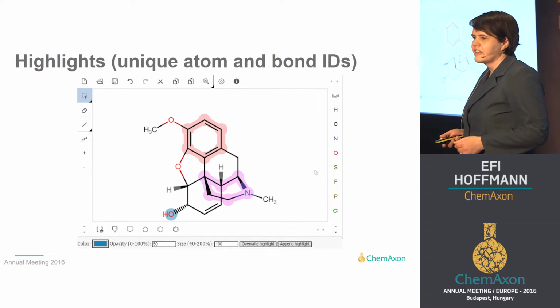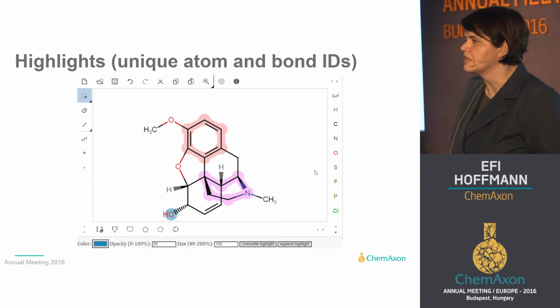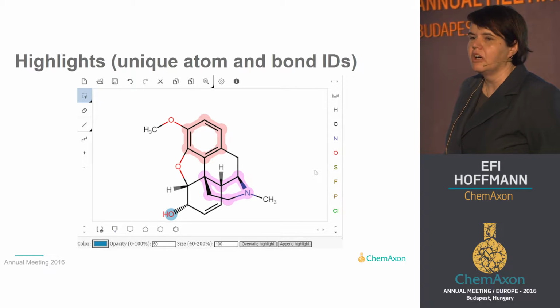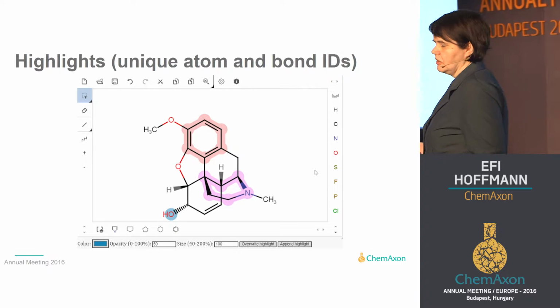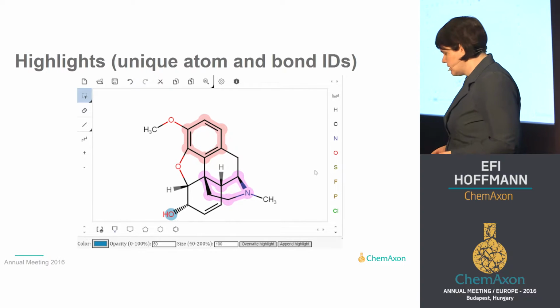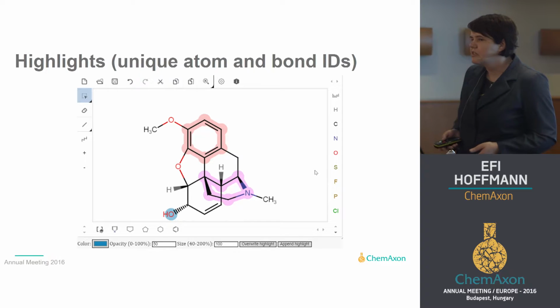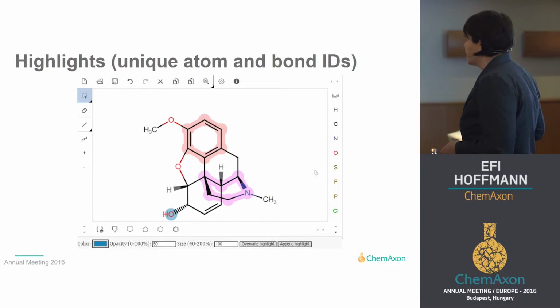The other magical thing which we just introduced this year is highlighting. You can now add color patches to the atoms, to the bonds, or for the selections. Why is that important? What can you do with it? For example, András uses it in Marvin Live, showing who modified the molecule with different colors based on the users' names. But if you want to display a calculation result on a color scheme, for example the pKa result, you can also color it based on the value. And this feature is quite unique in Marvin JS because we don't even have it in Marvin Applet.